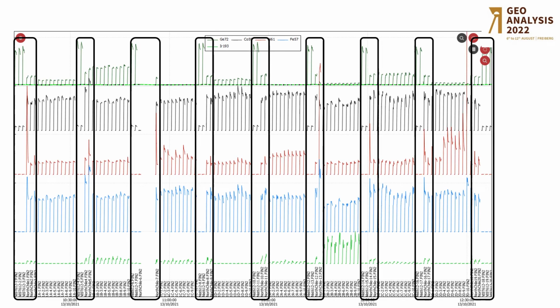Our analytical sequence was planned to construct calibration blocks formed by NIST 612 and North Chile. The time-resolved blocks interpolation generates calibration surfaces that are applied for the calculation of unknown samples. The calibration blocks are repeated each 10 unknown sample spots, or around each 15 minutes. We adopted the mean of 10 spots for unknown samples.